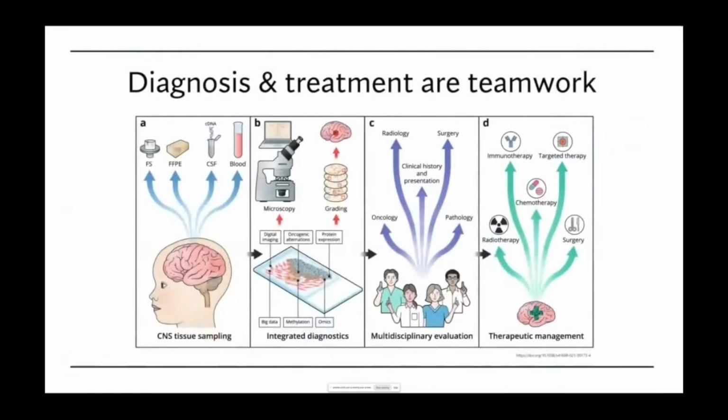So this is a particular challenge, and of course the enormous teams that work together to do this have to work together in a coordinated way. CNS tumour diagnostics are challenging and rely on integrating multiple different data types and pooling that information together to give a classification of a specific tumour. And so this is a challenging process that takes plenty of time and effort.